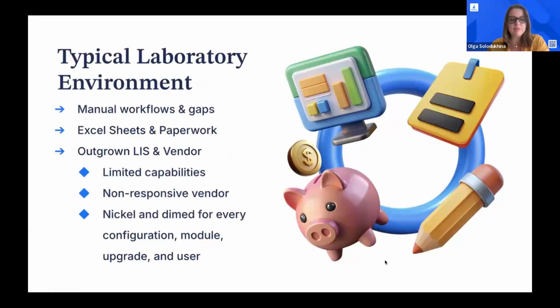Moving forward, I just wanted to touch a little more on the gaps and problems that regular labs face nowadays, all the manual workflows and processes, and still a lot of processes on Excel sheets and paperwork inside the lab. That's something we see every day when we visit the labs, even those of bigger size and scale. Still lots of gaps exist there. And I think some of you here today also have these problems.